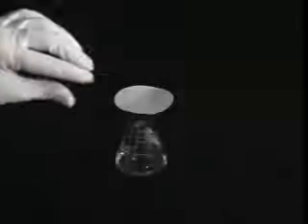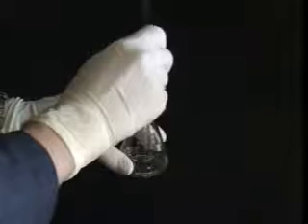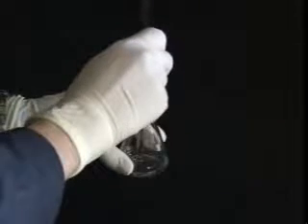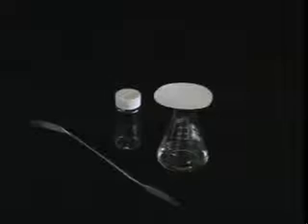If the solution reaches room temperature without crystal growth, you may want to try a trick or two to jump-start the process. First, try scratching the side or bottom of the flask with a glass rod. Don't press too hard or you'll break it. If that doesn't work, try adding the seed crystal that you set aside at the beginning.